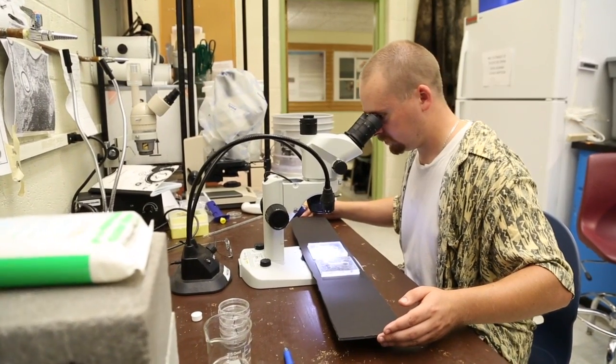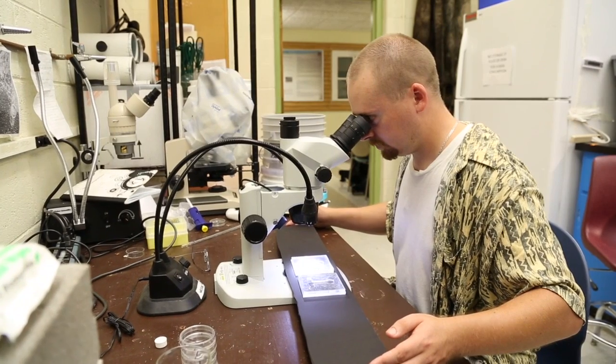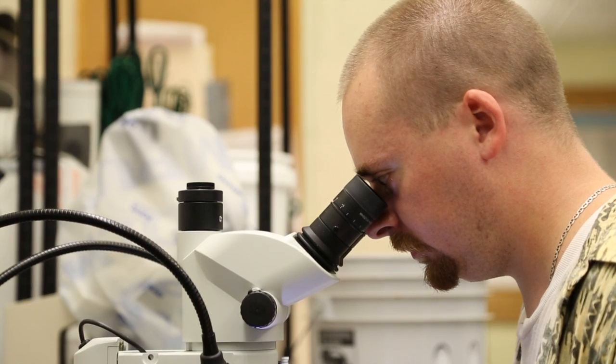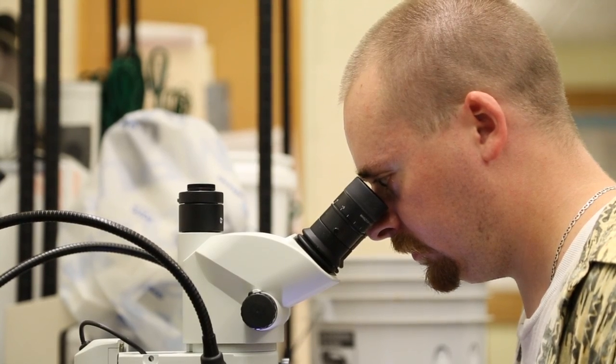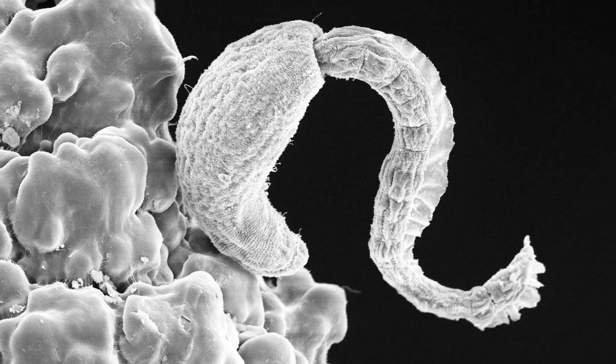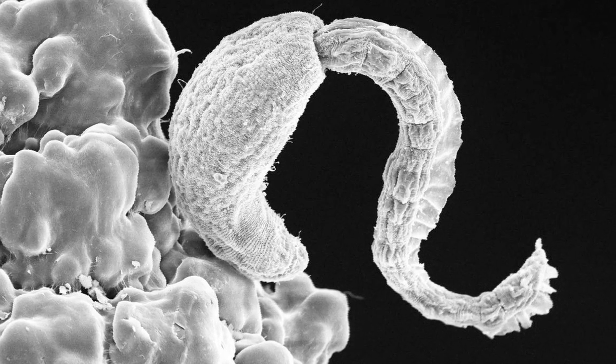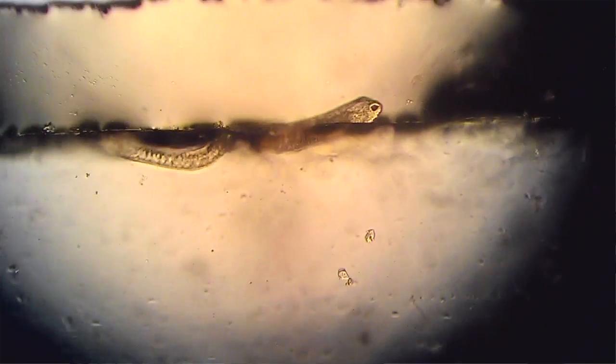What I'm trying to do is see if collagen or gelatin will attract these parasites. Trick it into thinking that this lump of gelatin is actually a snail. And so it will burrow into that lump of gelatin and we can see what it's doing as it's entering.